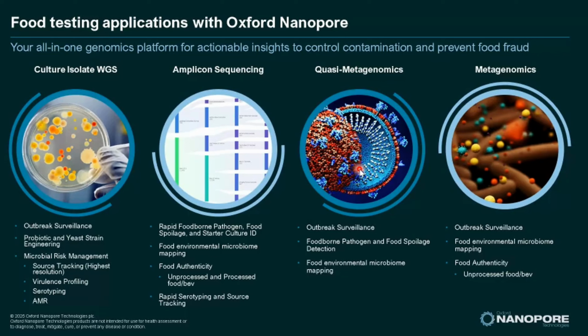The entire workflow focuses on the detection of Salmonella, E. coli, or Listeria only. Again, this purpose is to shorten the entire flow from the sample in question until the detection of the potential foodborne pathogen. And lastly, metagenomics is basically non-specific. We do not have any target, but we are detecting everything inside the sample.